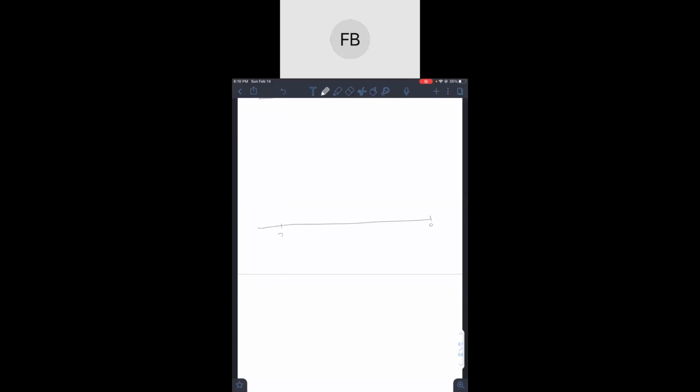The graphs they showed right here aren't that good, which is one of the complexities of dealing with NMR. But basically, that's where you can tell where your cyclohexanes are, and it will tell you if your cyclohexane has a para or whatever. Also, I should take that back, they're not just cyclohexanes. They're benzene rings, so they're aromatic.